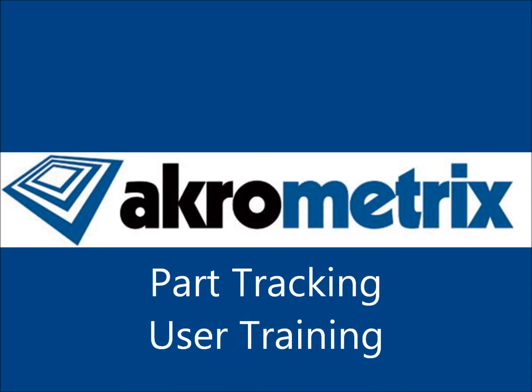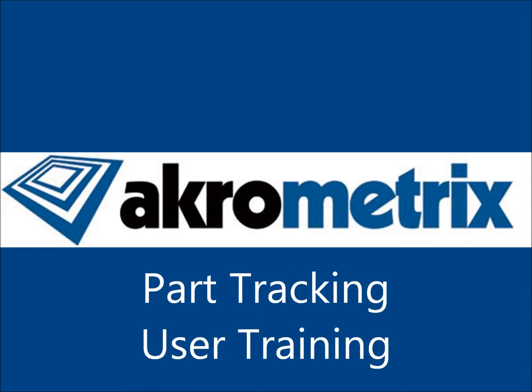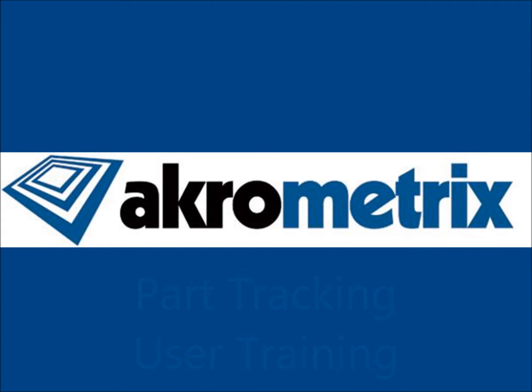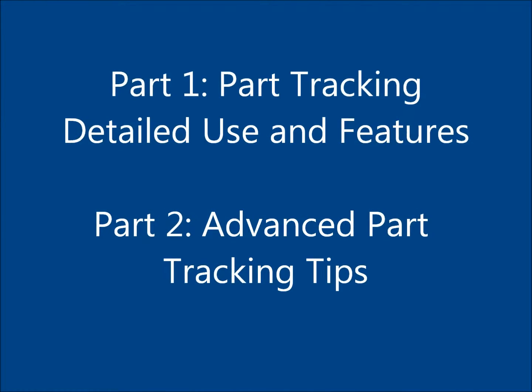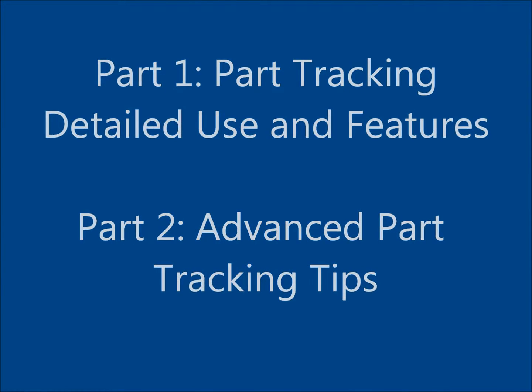Anyone watching this video should have already viewed the Akrometrix Introduction to Part Tracking. From the introduction video, you should have a general idea of what the new part tracking feature is all about. In this video, we will first go through the use and features of part tracking in detail, followed by some advanced tips and concepts that users should be aware of.